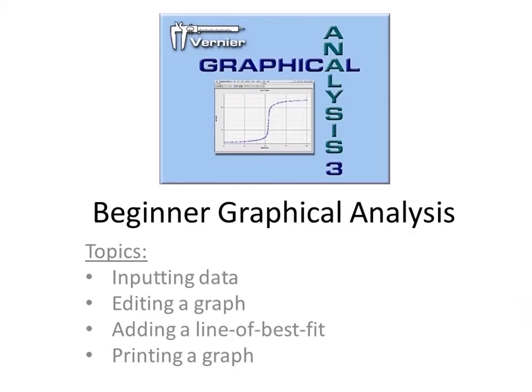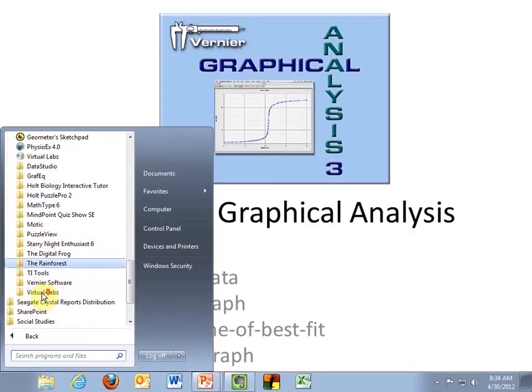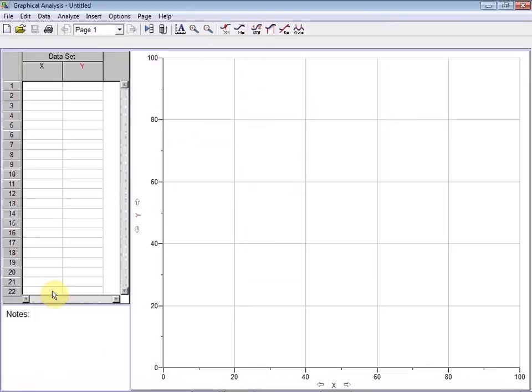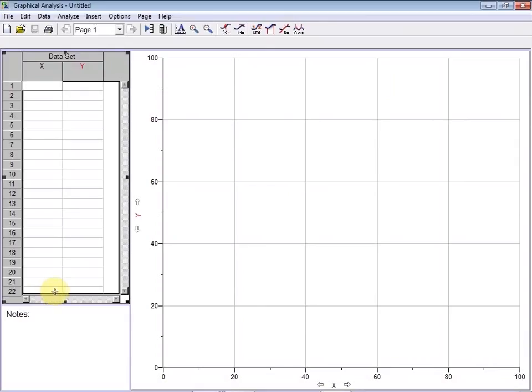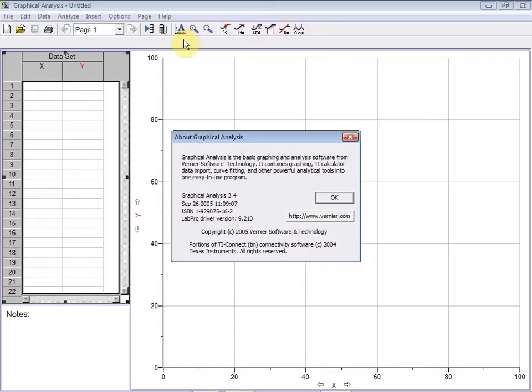Welcome to the beginner graphical analysis video. In this video, we'll go over inputting data, editing a graph, adding a line of best fit, and printing your graph. This video was produced in 2012 using Graphical Analysis version 3.4. Future updates and other versions of the software may vary, but these basic concepts and instructions should be enough to get you started.